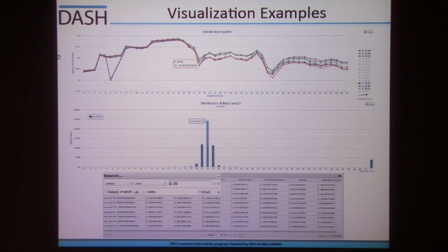So I went to a couple meetings with my mentor to talk to Dr. Burns and Dr. Shimizu about what they'd like to see. So in the end, it was kind of an end user meeting. One of the things that they said they'd like to see was an overlay for anomaly detection for base quality. So I created this graph here.